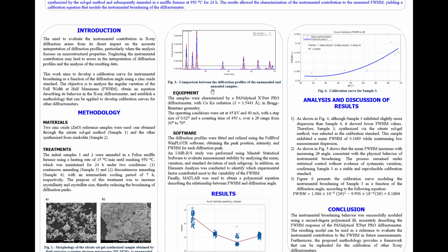The instrumental broadening behavior was successfully modeled using a second-degree polynomial fit, accurately describing the FWHM response of the PANalytical Expert Pro diffractometer. The resulting model can be used as a reference to evaluate the instrumental contribution to the FWHM in future measurements.